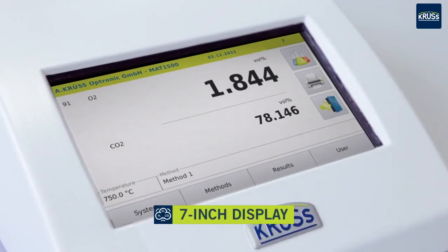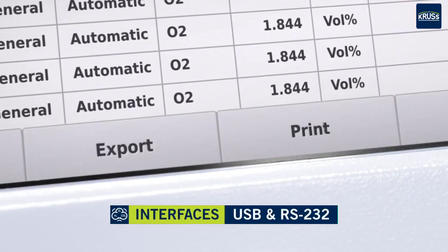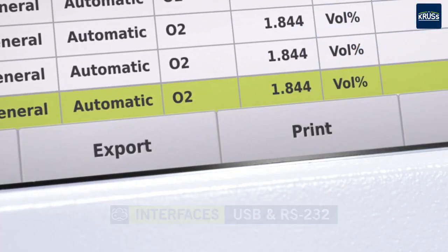The gas analyzers feature modern sensor technology. Measurement data collected during quality control is digitally archived on the system or printed directly.